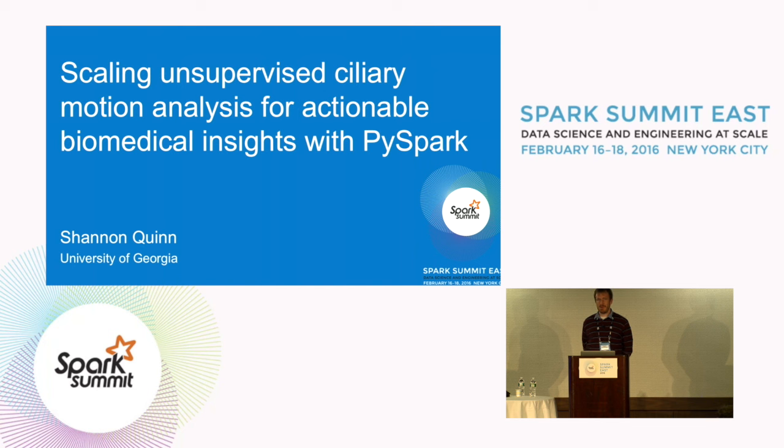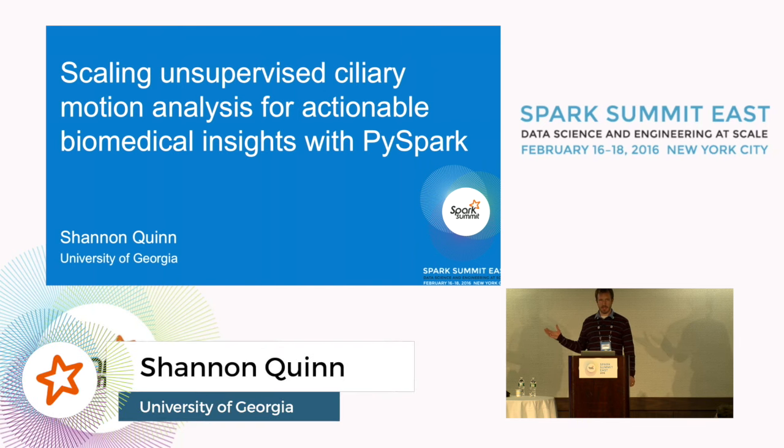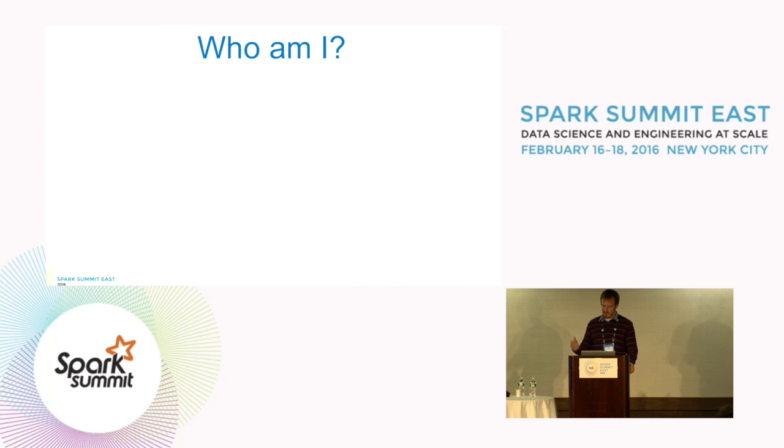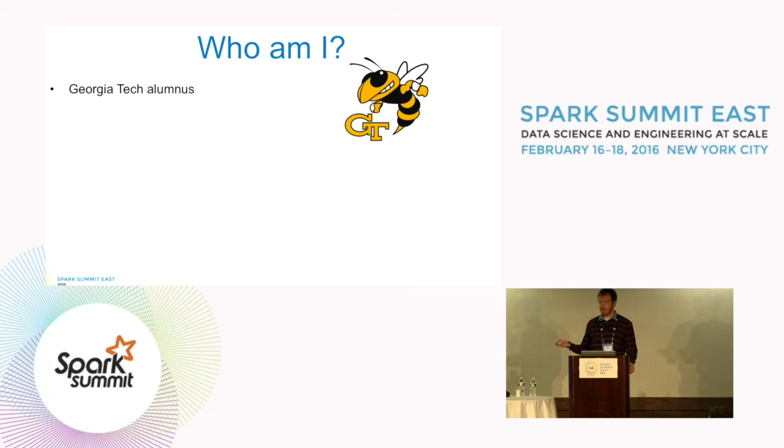Hi everyone. So I'm going to discuss a little slice of my research. I'm looking at cilia and in particular doing biomedical imaging to try to quantify some of the observations that we're making. And specifically we've been making heavy use of Spark because the data sets that we're working with have exploded to be rather large.